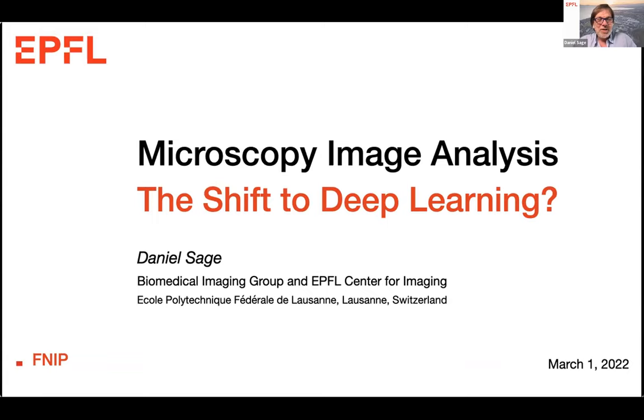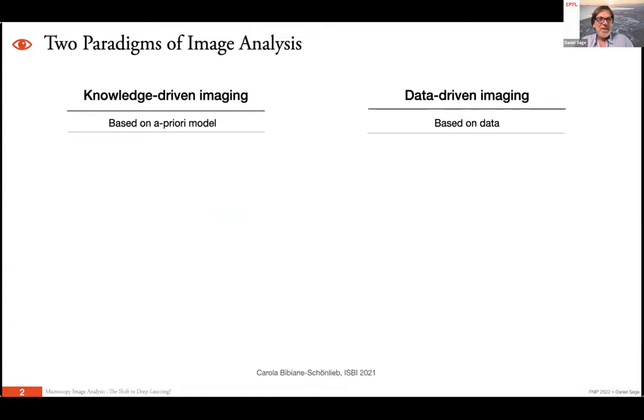Today I have a talk which is entitled Microscopy Image Analysis, Do We Shift to Deep Learning? So I will try to give a few answers to this very large question. We are all now faced with two paradigms in image analysis: the classical paradigm, which is driven by knowledge and based on a priori models, and on the other side, the more modern one, which is driven by the data.